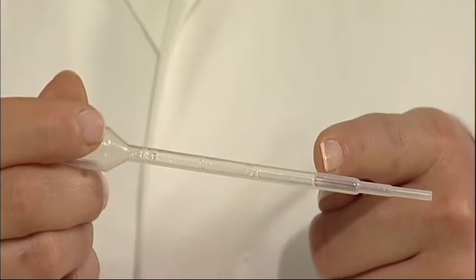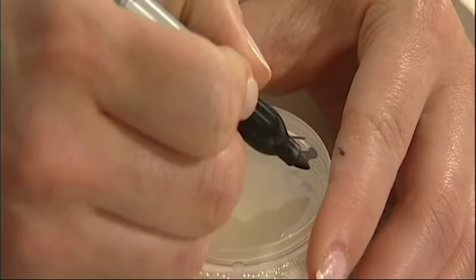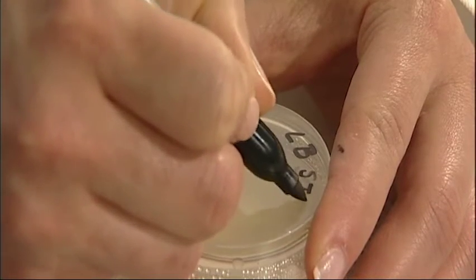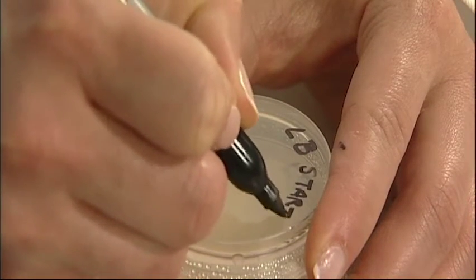This is the quarter of a mil mark on the transfer pipette. Allow the bacteria to stand for five minutes at room temperature. Meanwhile, label eight LB plates starter.